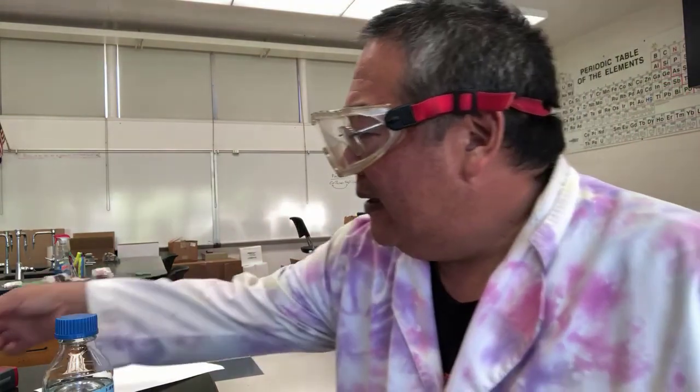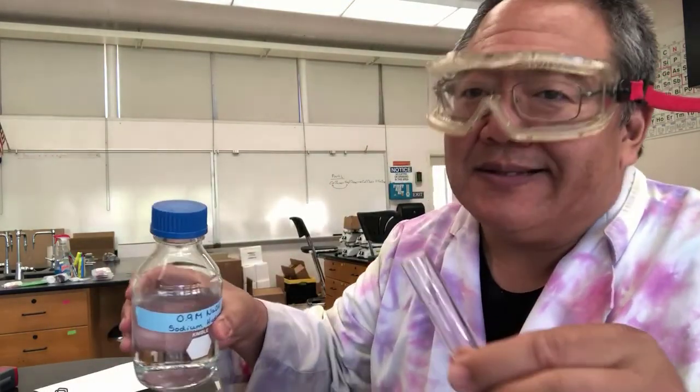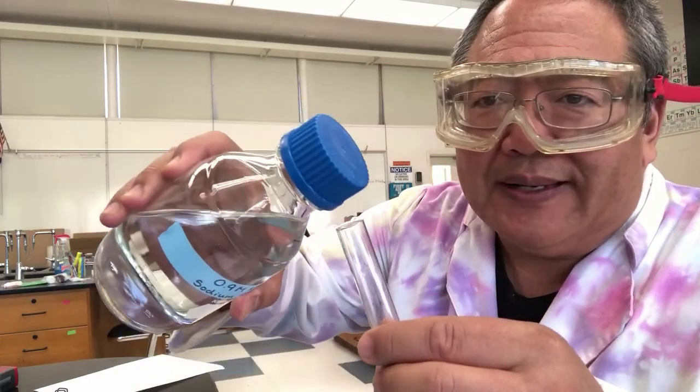Okay, so a couple of things about handling chemicals. There are some things that I'm not reading off this list, just the things that I think need to be emphasized. The quiz will include questions potentially from all the items on the safety sheet, including the things I say in the video. Let's say you needed to get some sodium hydroxide, right? This is not on the sheet. Don't pour it like this, okay?